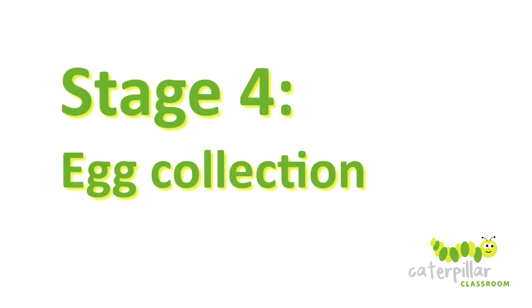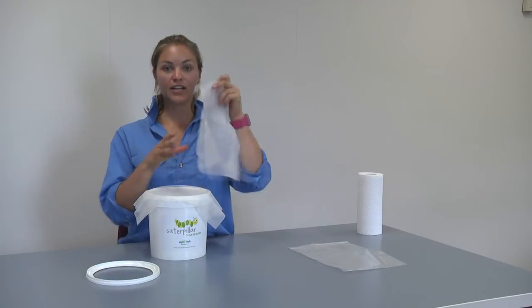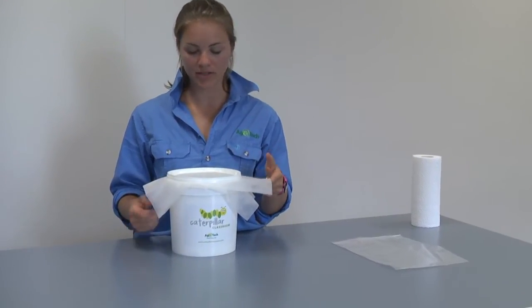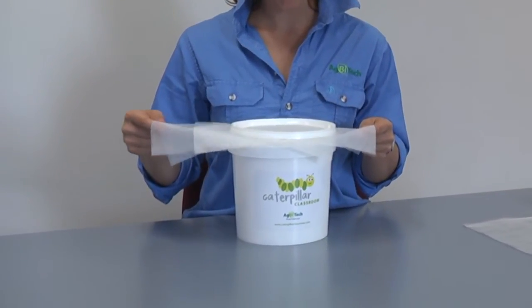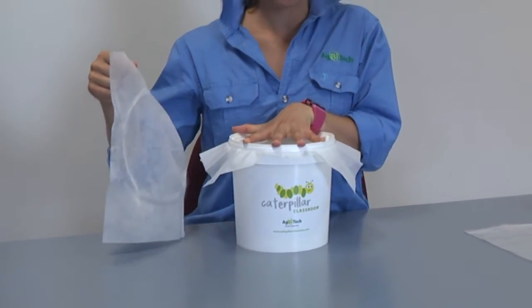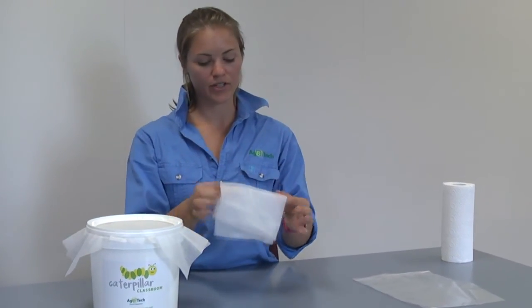I'll now walk you through the steps of how to collect these eggs so that you can continue rearing your Helicoverpa colony if you wish. The first step is to remove the lid from your bucket carefully. Take a new nappy liner and place it on top of the old nappy liner that has the eggs on it, then place the lid gently on top. Hold the new nappy liner at one end and at the opposite end pull the old nappy liner with the eggs out from underneath, doing this carefully to minimize eggs falling off and to stop any moths from escaping. Then close the lid down so that your moths can't escape.